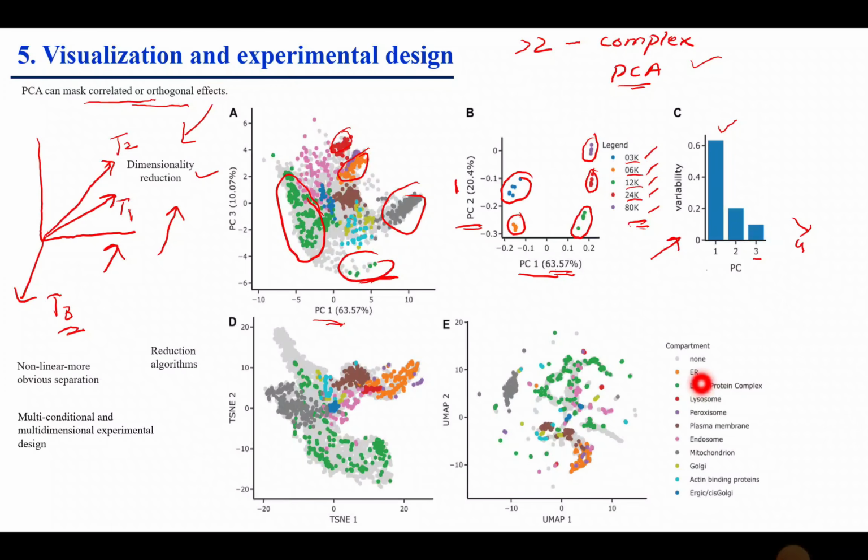So it means PC1 is always higher than PC2. You may also notice that this type of principal component analysis we often observe in the transcriptomic data. But what about if there are more outliers? Then we apply two different algorithms.